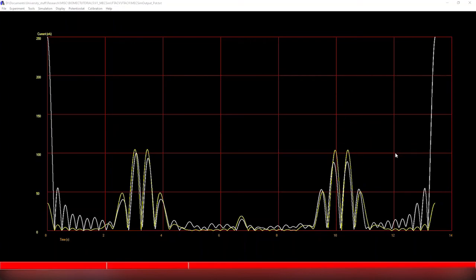But that's very time consuming and not the best use of my time, where I could send this off to a computer, have it run the analysis on the average of all the experiments, or all the experiments overall, come back after I get a coffee, and have the parameters best fit. The important thing to know is we have a MECSim file, which gives us a good parameter guess. We also have a good approximate estimate.